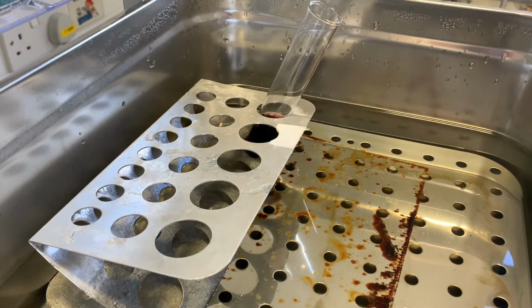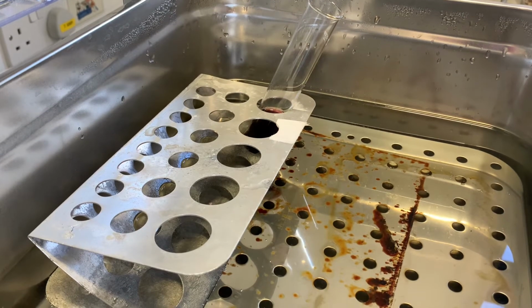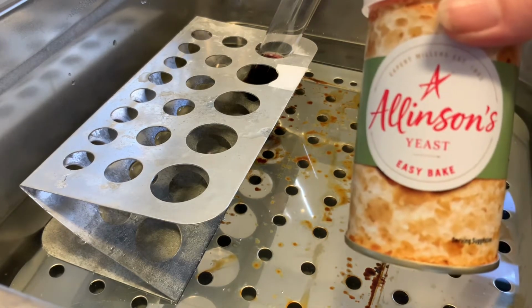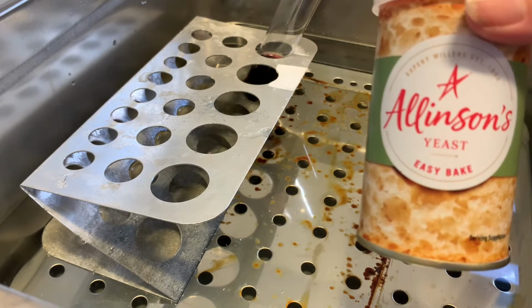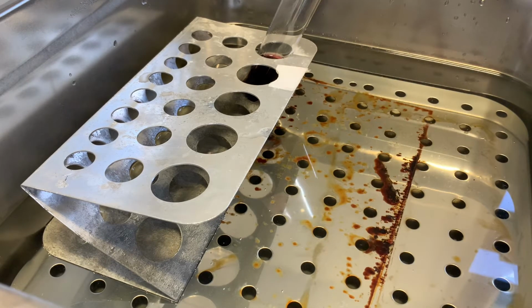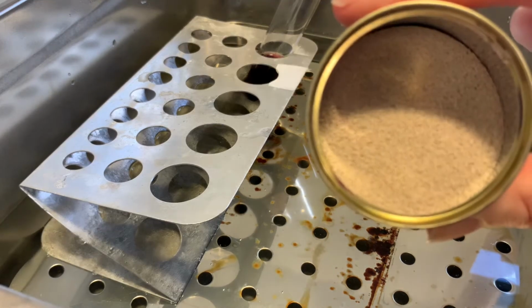So the purpose of this experiment is to show that yeast can ferment sugars to produce alcohol. What we mean by ferment is that they can respire in the absence of oxygen. So we are going to use some yeast, which is what we use to make bread, and this type of yeast is dried yeast. You can buy it in the supermarket and it looks a bit like this when it's dried.